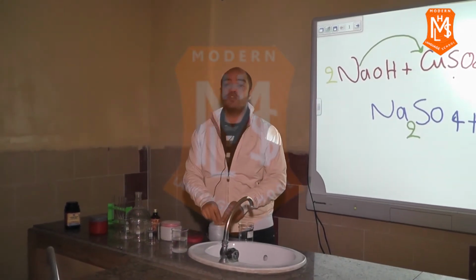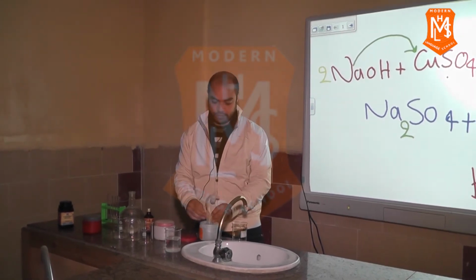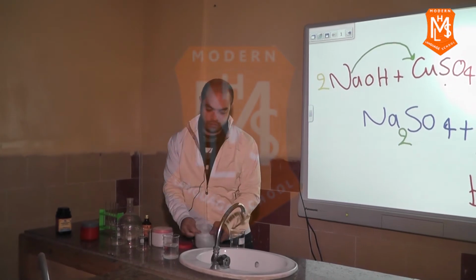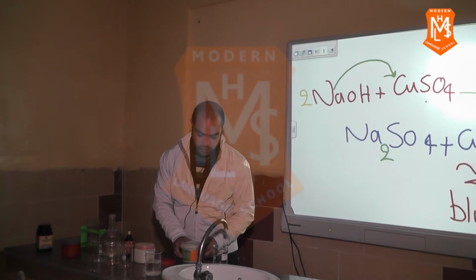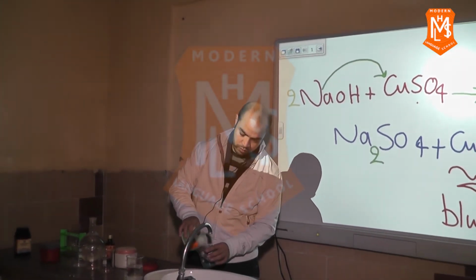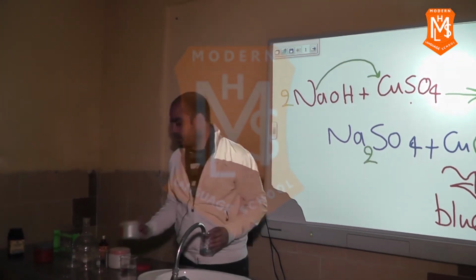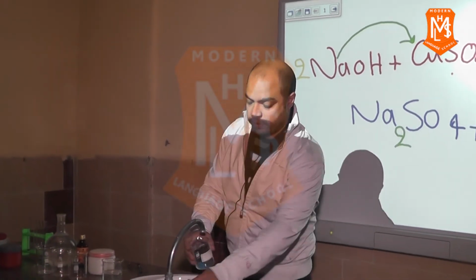Put some copper salt solution such as copper sulfate, then dissolve it in water.